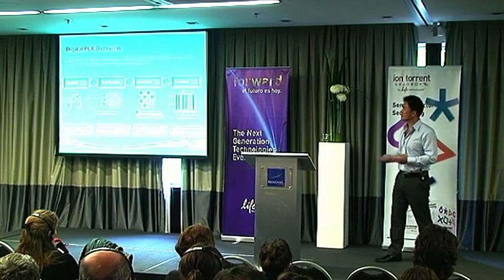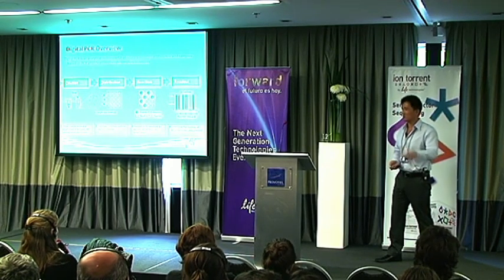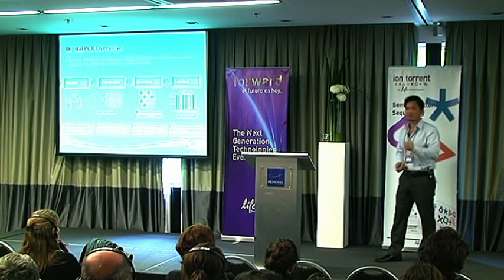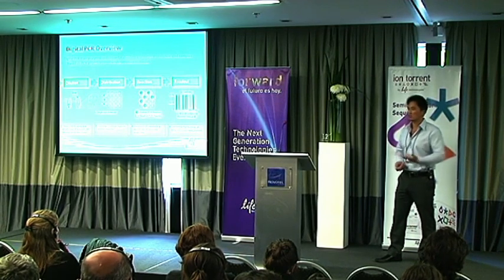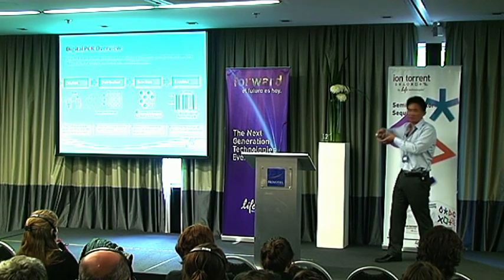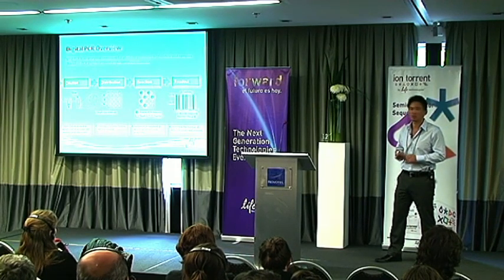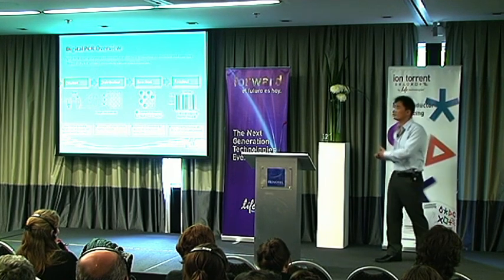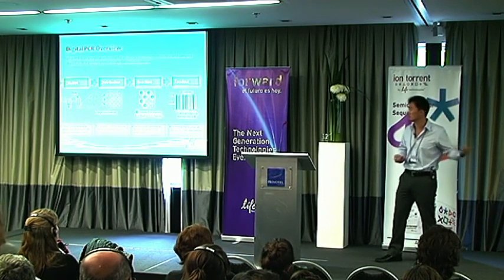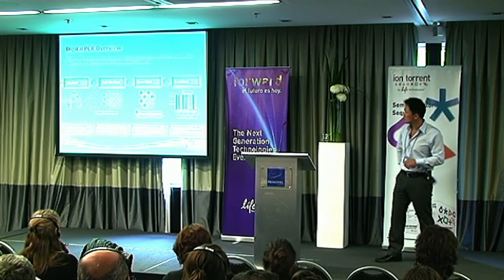Because how do you know that if you take your sample and split it across 96, you really are going to get single copies in there, right? You actually may end up with 1,000 copies in a well, 1,000 copies in the next well. So you have to do a lot of work pre-diluting your sample so that it fits into the dynamic range of whatever vessel or plate you're using, 96 wells or 384 wells. So in reality, digital PCR was just not very applicable, until now, when we've released these mid-density arrays, with the ability to distribute that sample across 3,000 wells, right? So you just gain an order of magnitude. And that's basically digital PCR, an overview description.